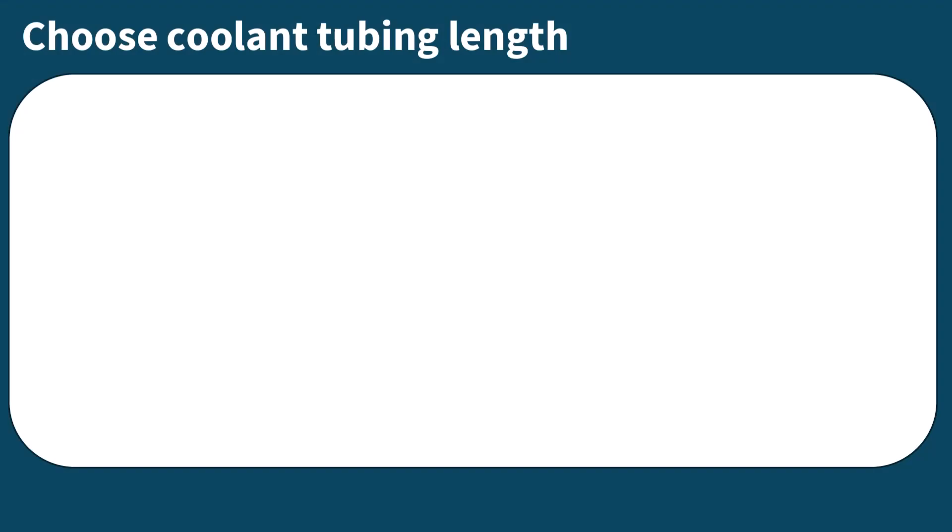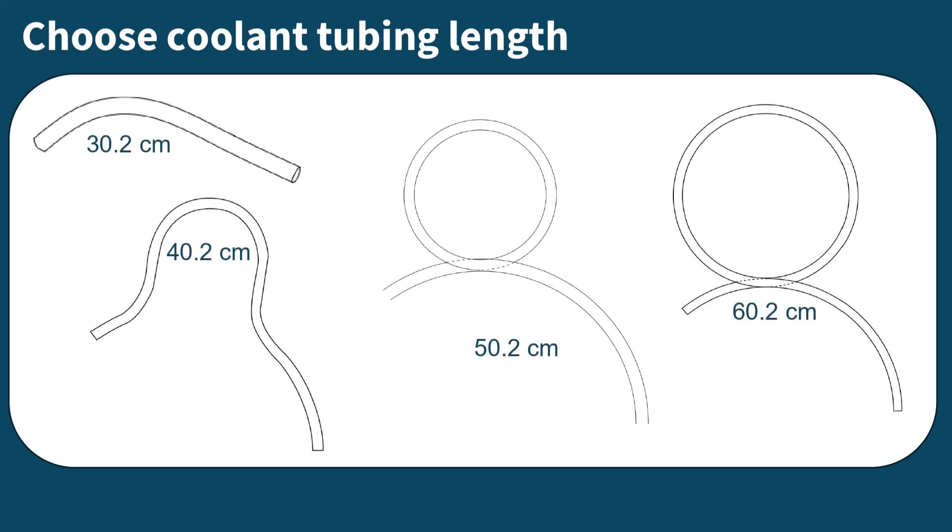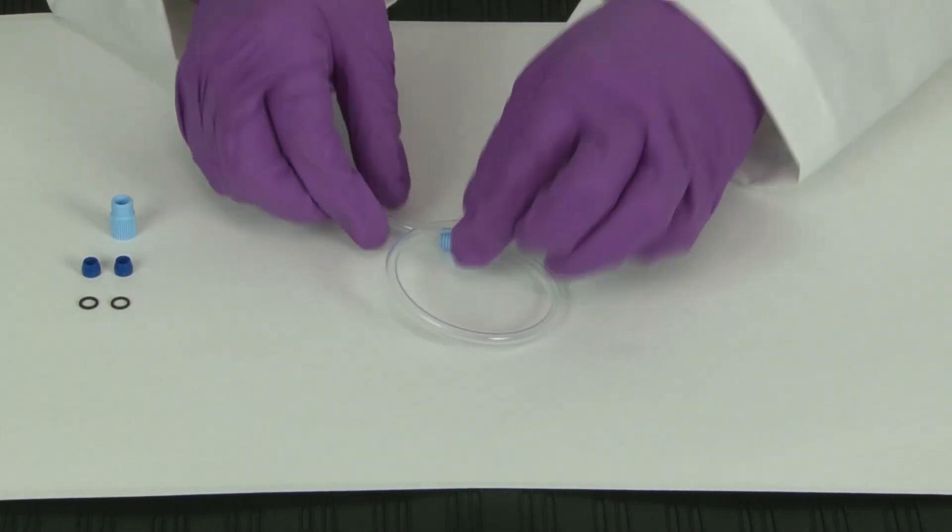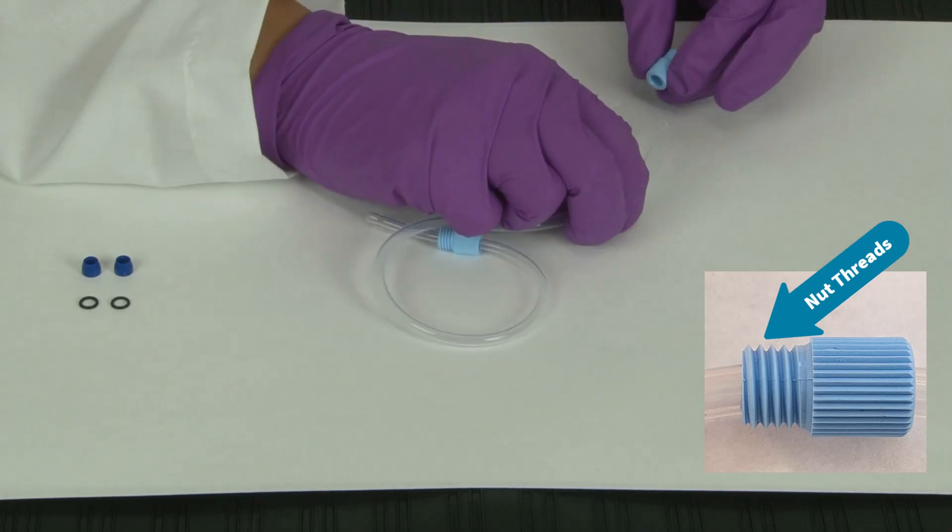Next, choose the proper length of coolant tubing to correspond with your capillary length. Then add the light blue nut so that the nut threads face the end of the capillary tubing.